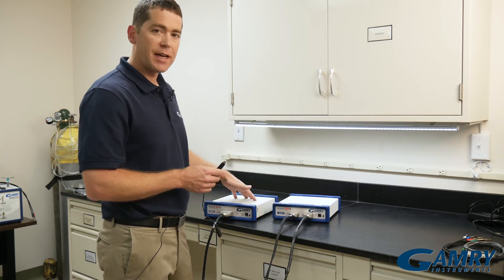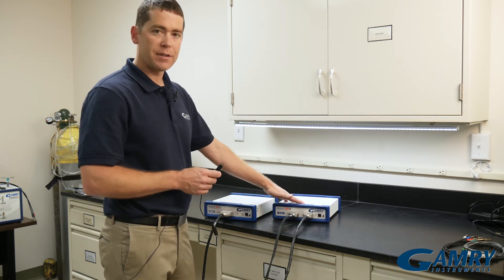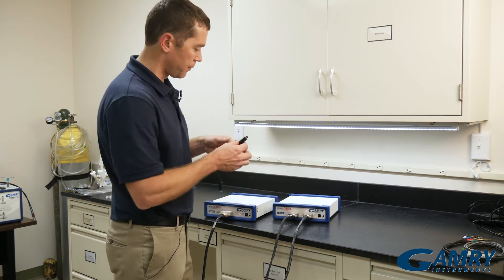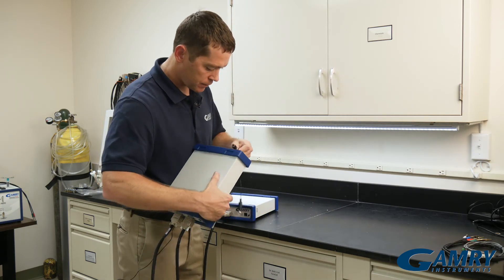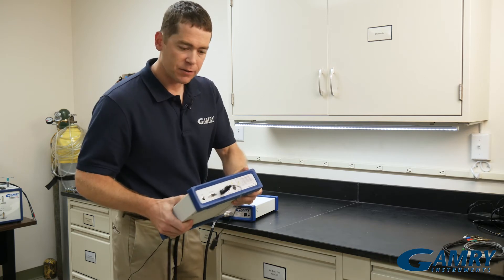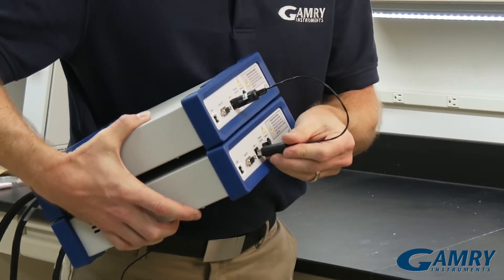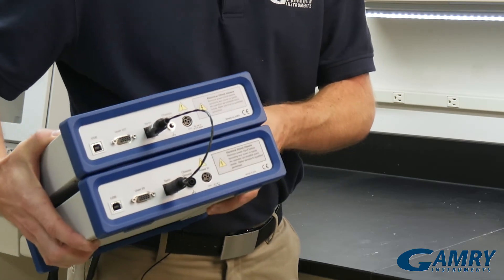The second potentiostat will be acting as what we call the 'slave.' This controls the timing during your experiment, and you can run any number of typical bipot experiments that you need. Creating a bipotentiostat is as easy as simply plugging in the sync cable to one instrument and plugging in the sync cable to the second.